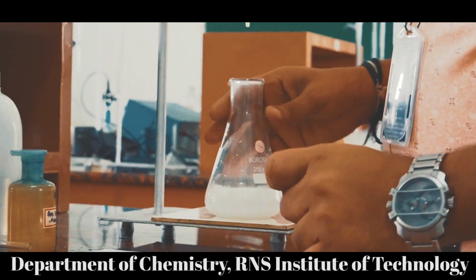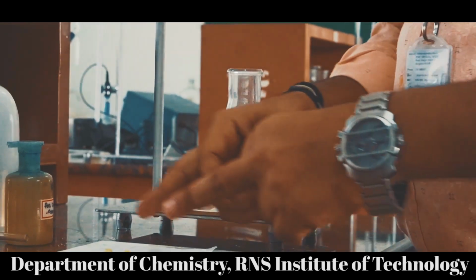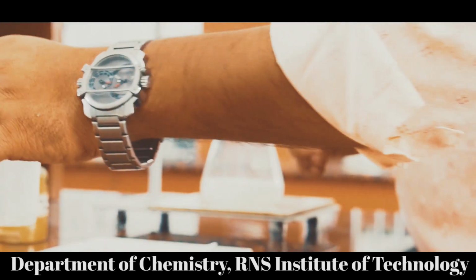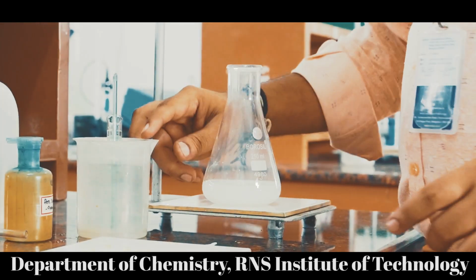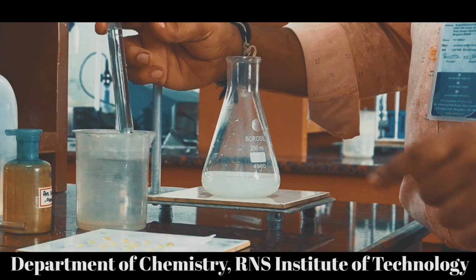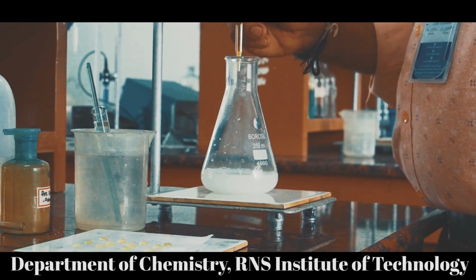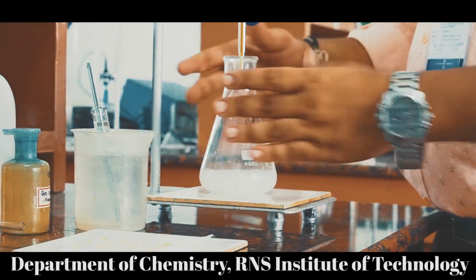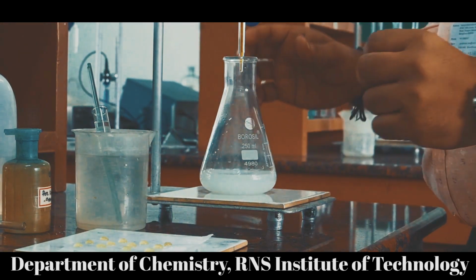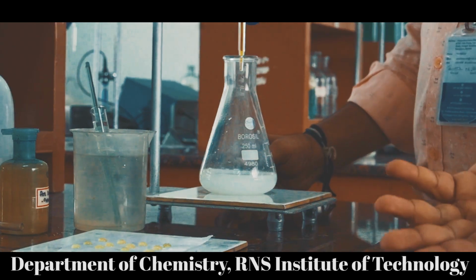So now we can go for this titration. Before starting the titration, you have to take the indicator droplets like this, and you should keep ready this beaker containing tap water and a test tube containing distilled water and a glass rod. So first let us add around 7 ml, and then we have to check. After adding 7 ml only, we may have reached the end point.